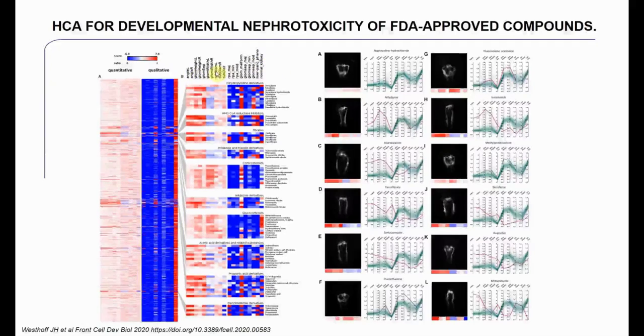Now that you have all of these individual scores, what you can also do is take those, and those are now a profile that you can use to classify different toxic compounds. Here we see an example of a negative compound, and then in red some positive compounds.